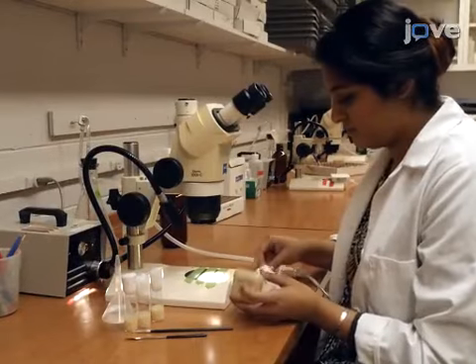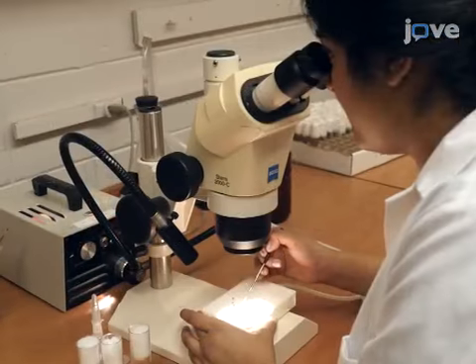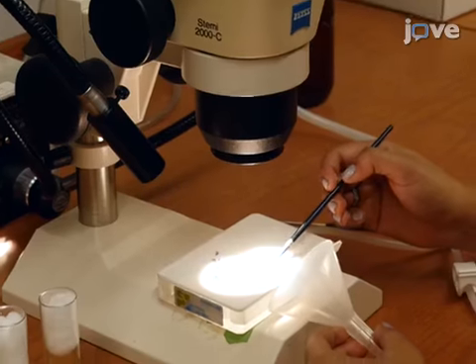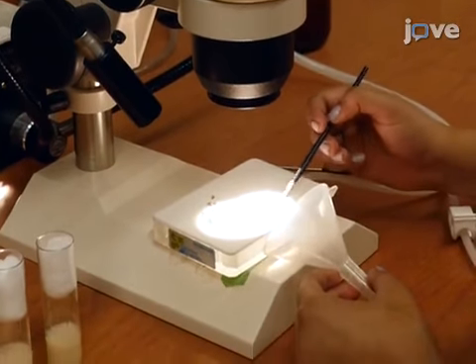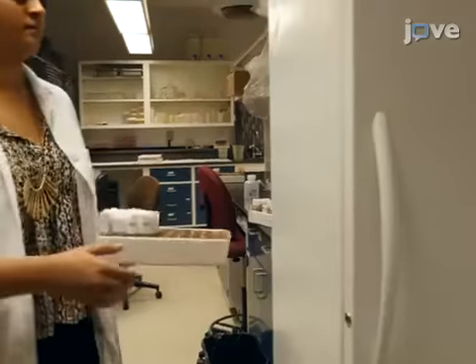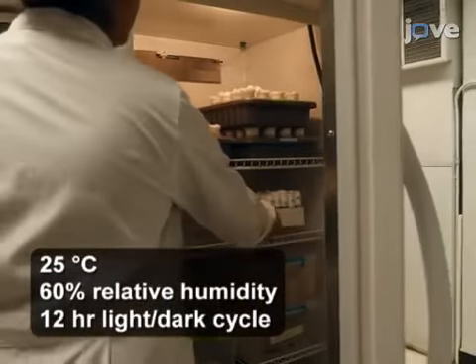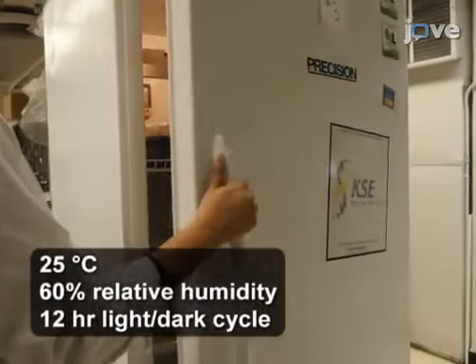To begin the experiment, collect flies in fresh food vials in groups of 11 of a single sex, using up to 5 minutes of CO2. Allow the flies to recover overnight in food vials in an environmentally controlled space.